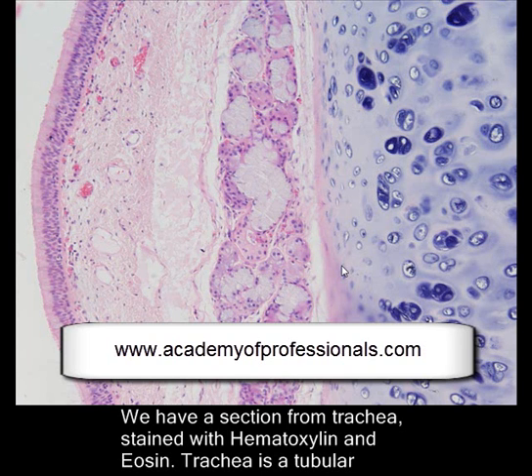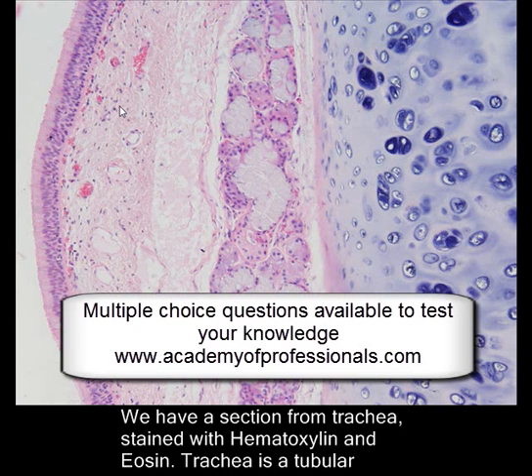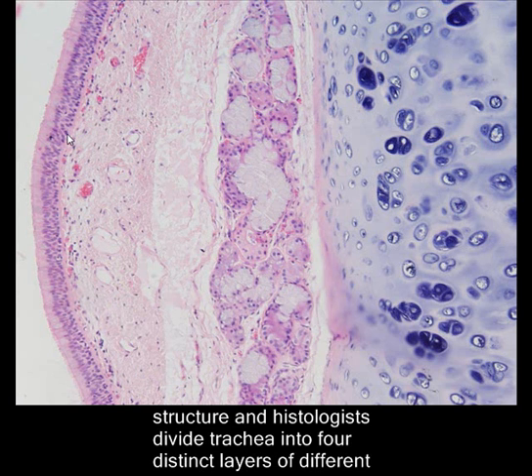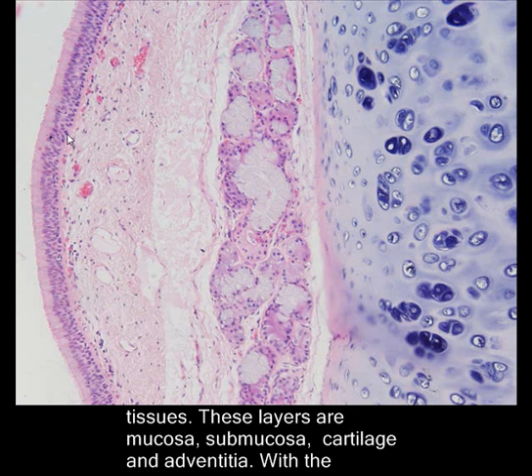We have a section of trachea stained with hematoxylin and eosin. Trachea, as we know, is a tubular structure, and histologists divide trachea into four distinct layers of different tissues. These layers are mucosa, submucosa, cartilage, and adventitia.